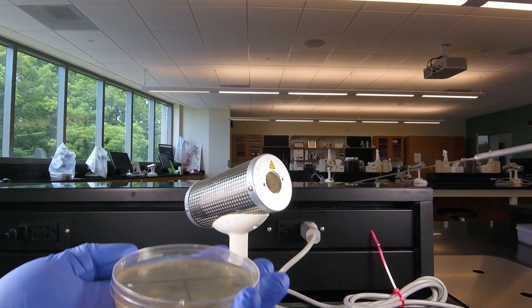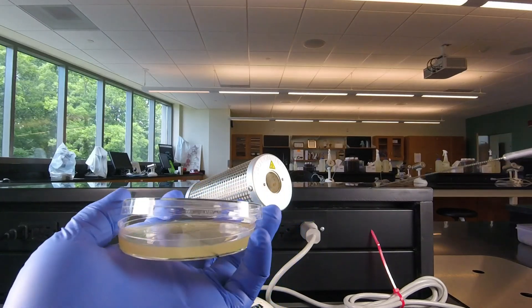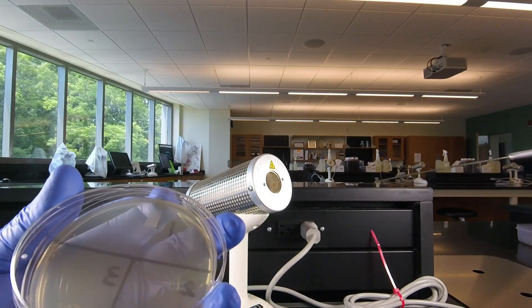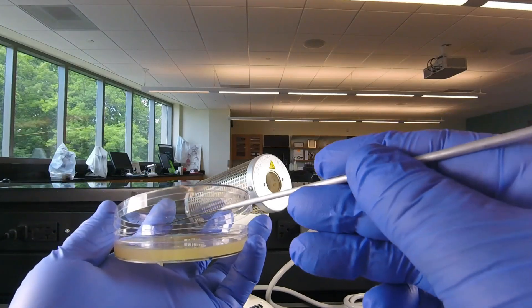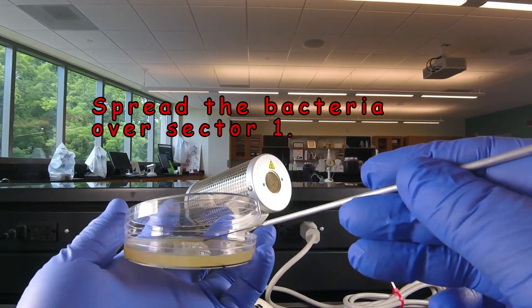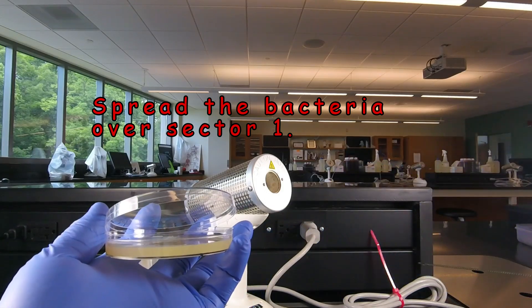Then we take our petri plate. As we mentioned under the tips, we're going to raise the lid just enough to get the loop in. We're going to streak sector one, which is at the 12 o'clock position, by going back and forth starting at 12 o'clock, pulling it towards you, until we've covered sector one.